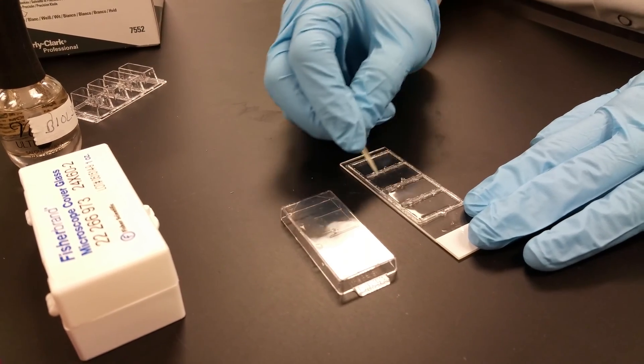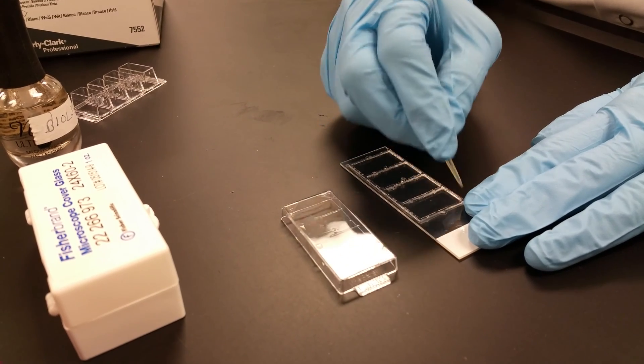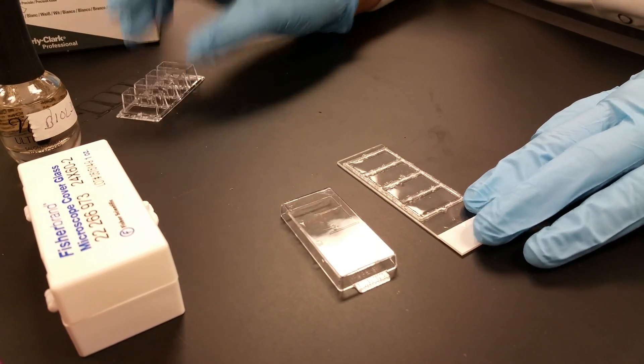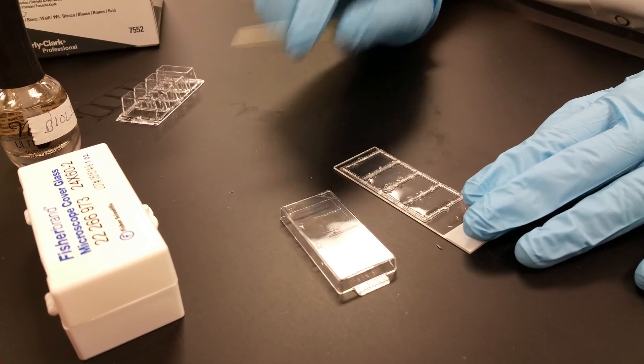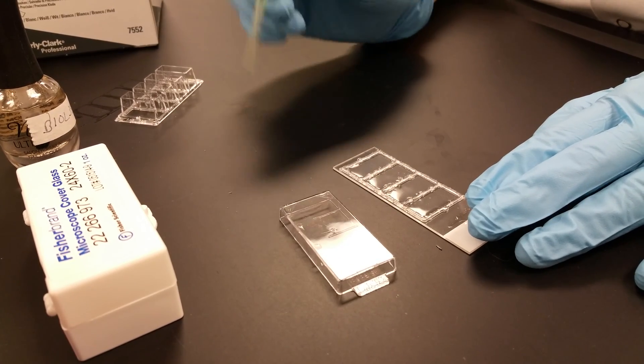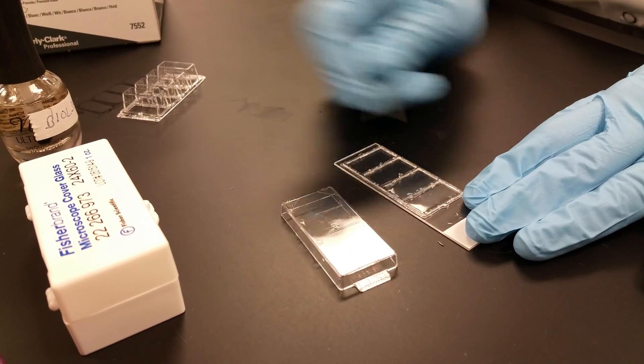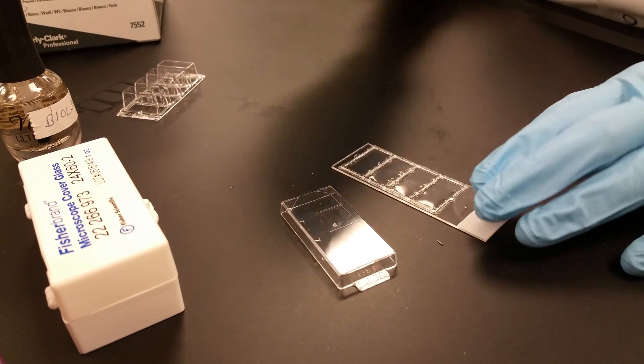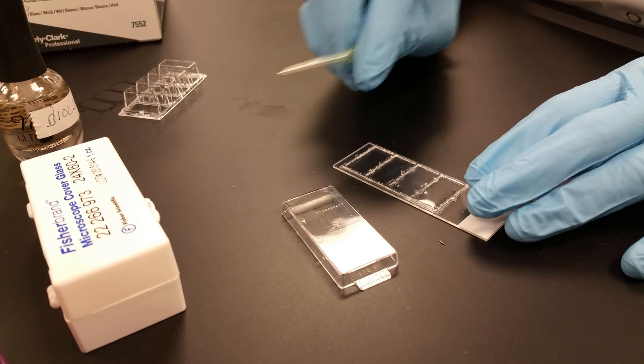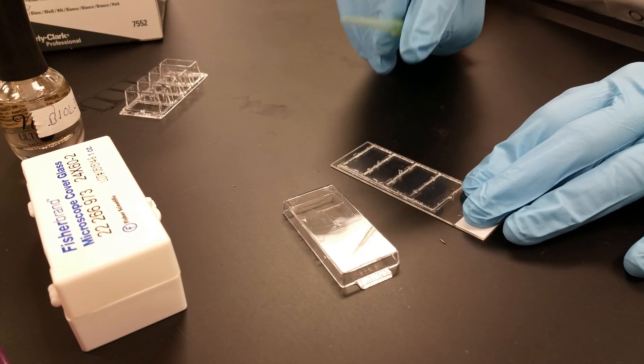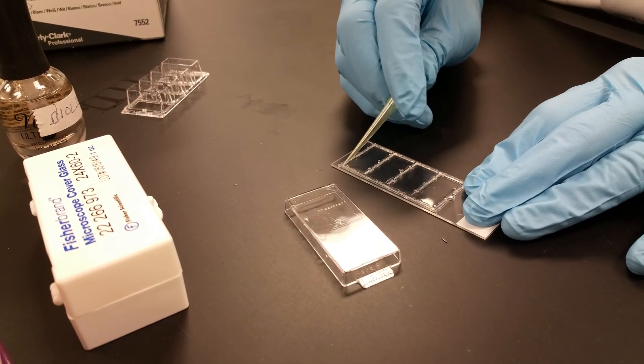Before you can mount the coverslip, you need to get rid of this glue that was holding on the plastic chamber. There are a number of ways you can do this. At your bench, you're going to have some razor blades. One option is to cut the glue and remove it with tweezers. Another way you can do it is like this: if you take a yellow pipette tip and aim it towards one of the corners, that will help you pick up part of the glue.